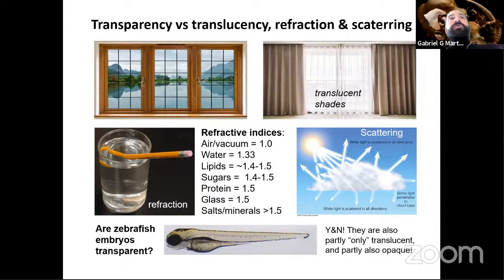Many of you probably remember doing this experiment in school, and it was not that easy to see the cells. You required special contrast techniques very often to see them. If you're working in a cell culture room and you want to look at your cells, you've noticed that you need a special kind of microscope that does phase contrast in order to see your cells, otherwise they're too transparent.